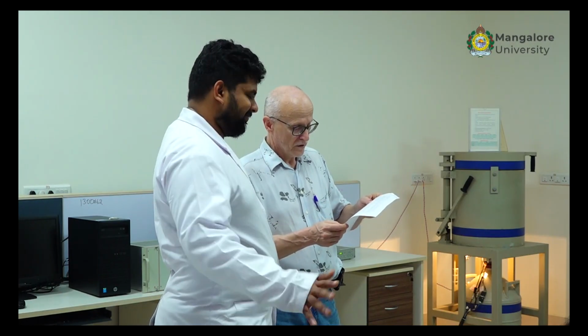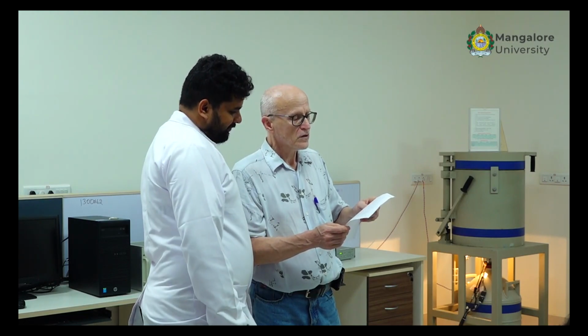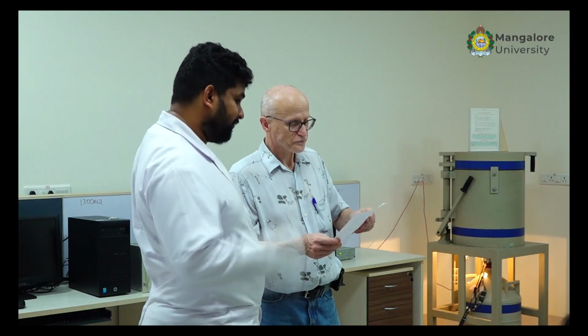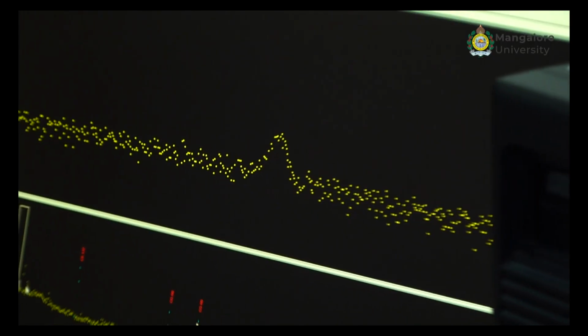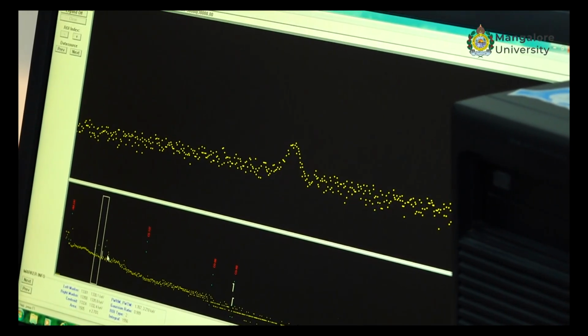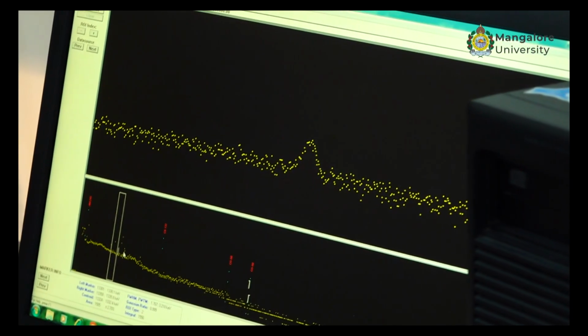If we talk of barium 133, if it is there for 356, so it is expected 302 also will be there, no? Maybe everything. 5 elements are barium. Once it is there, we should see individual evidence. That's the 302. Yeah, see, it is there. It is fine. You see the individual abundances, you will understand it.